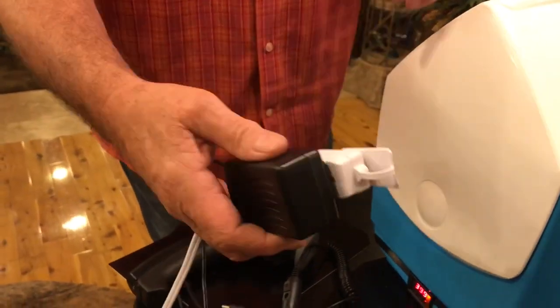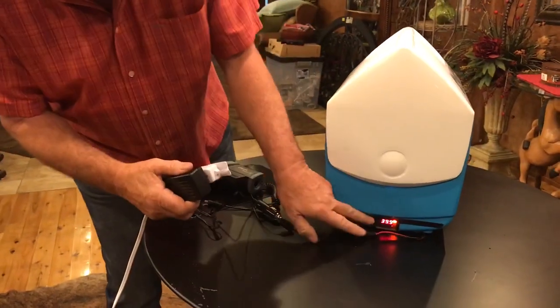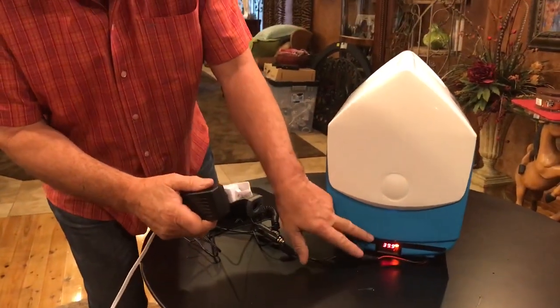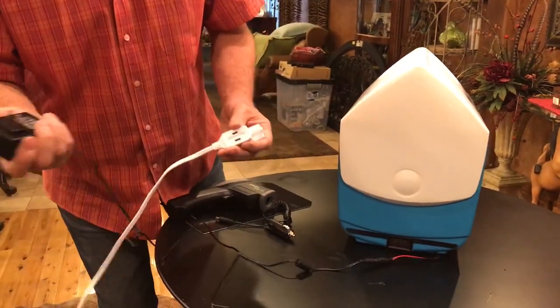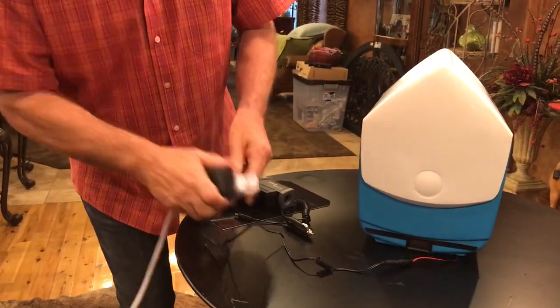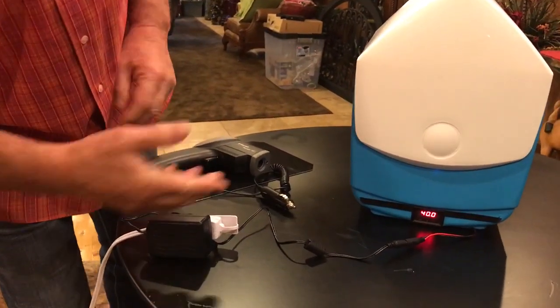It comes with this black piece right here. You can see it running. So this is in centigrade, set at 40 degrees centigrade. And interesting to see that when I plug it back in again, it remembers the last setting it had, so you don't have to keep programming it every time. So there it is, set for 40.